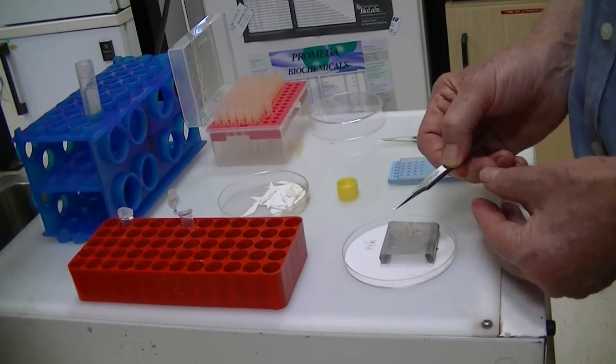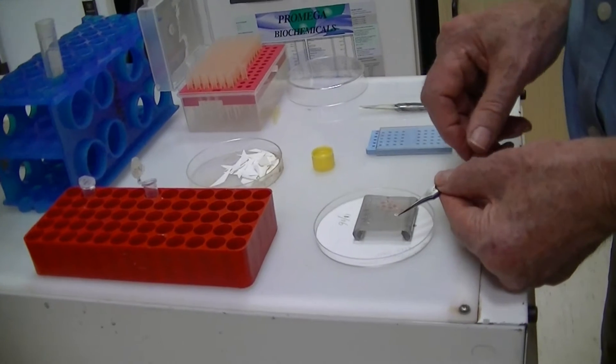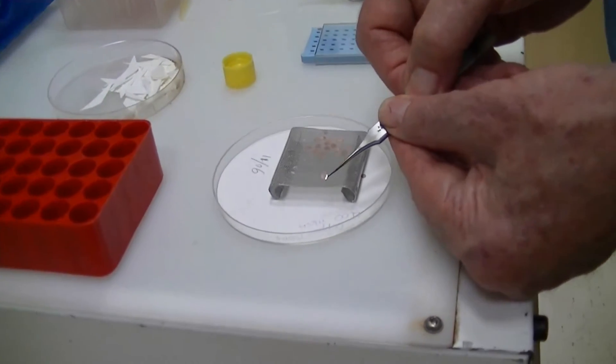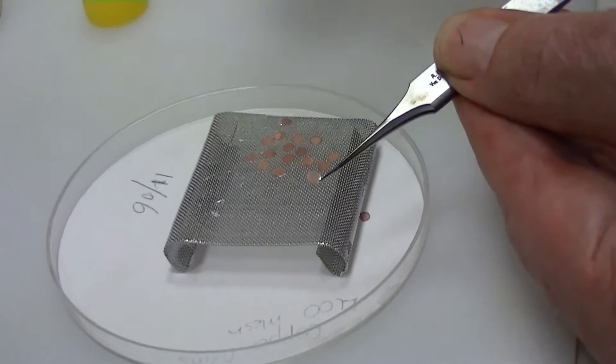To prepare samples for examination in the electron microscope, we place them on a copper grid which is around 3mm in diameter. You can see them here on this piece of stainless steel mesh.